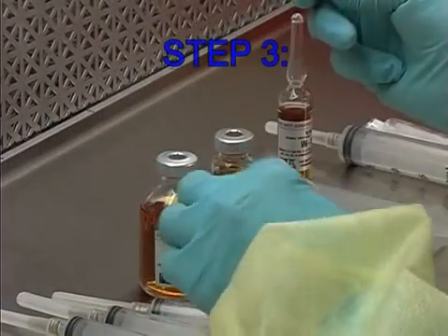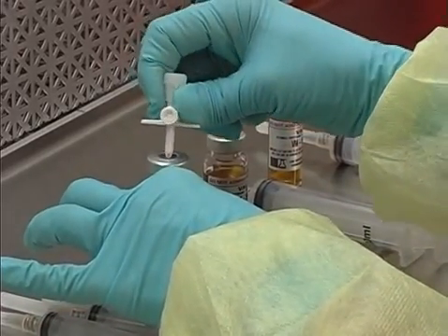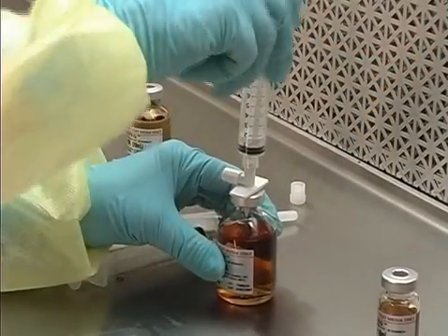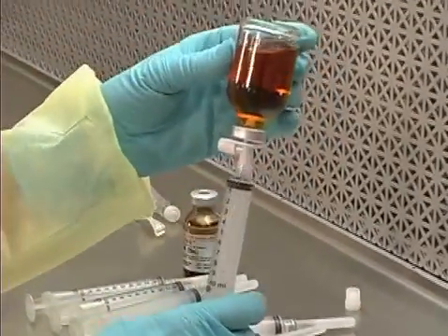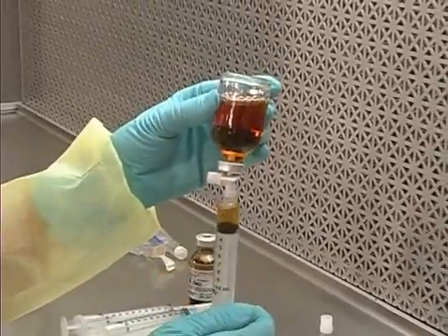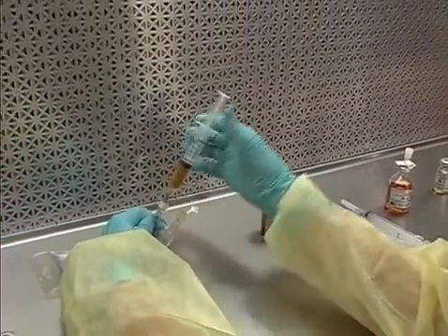Step 3: Insert a dispensing pen into the VM-30. Using a 10-ml syringe, withdraw 5 ml of VM-30 through the dispensing pen, add a needle, and transfer to the final container.